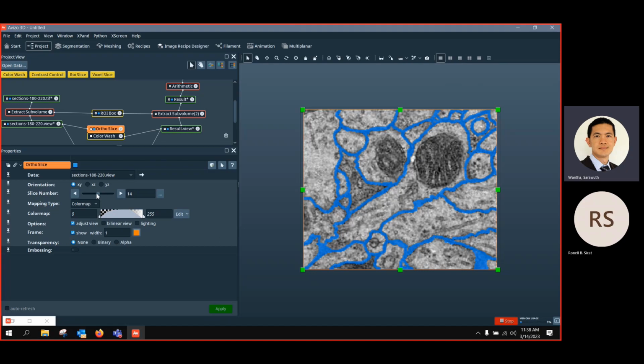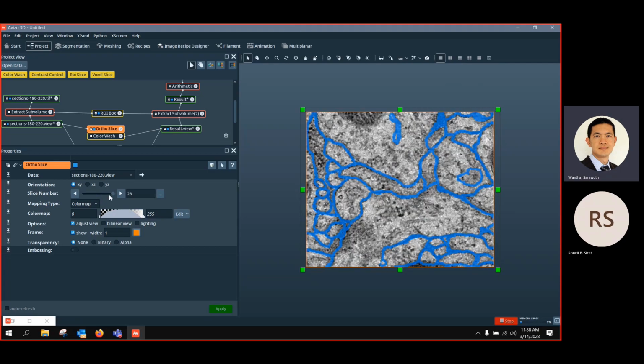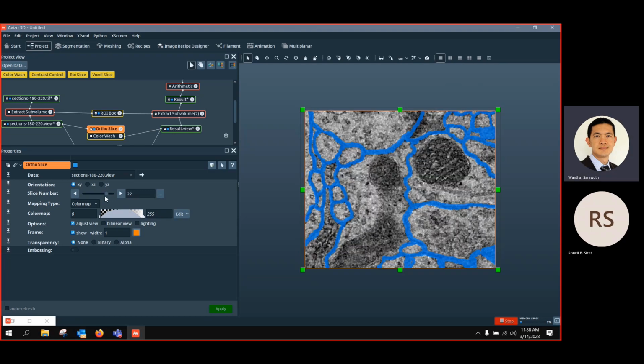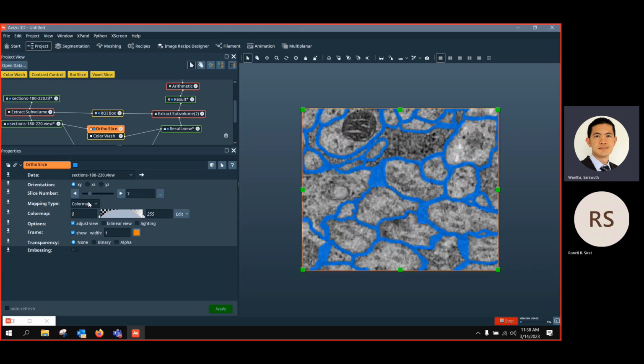So it doesn't seem to look repetitive to us. You can see that if you go to different slides, they're everywhere. They're not stuck on only one side, or only one position for one cluster. Then it could create a kind of bias also, first. Yeah, to the image.